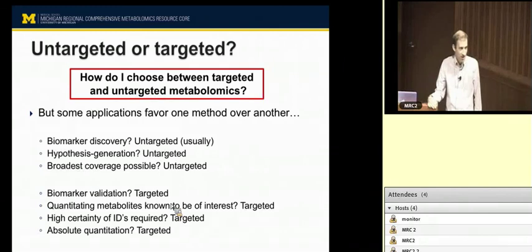You don't always have to do the technical replicate, and the core will make sure that if you provide us with a QC that you want to use in addition to your samples, that's fine. The core will always make an appropriate QC, sometimes multiple QC samples, to analyze with your batch. We may generate a pooled sample, a combination of all of the extracts of your sample set. We may run an additional quality control sample, like a pooled human plasma sample that we have in our archive, so we can compare it with other assays, other methods. So it's a very important part of any study.